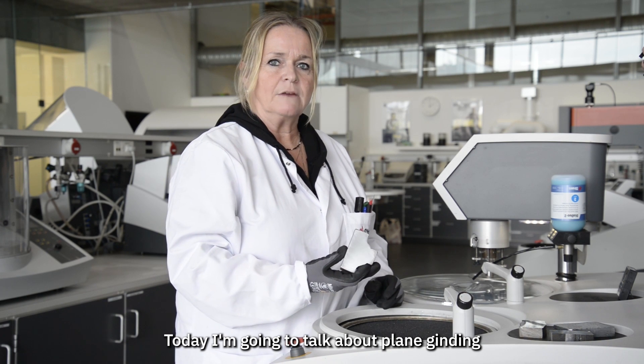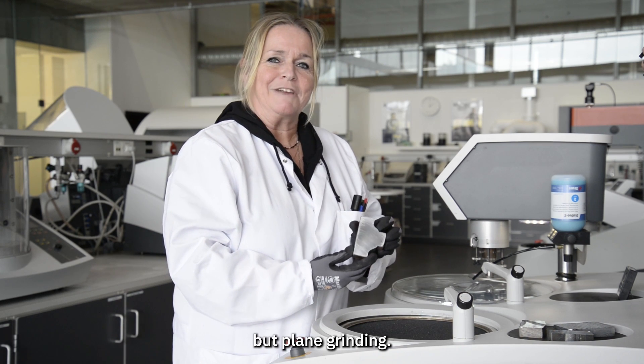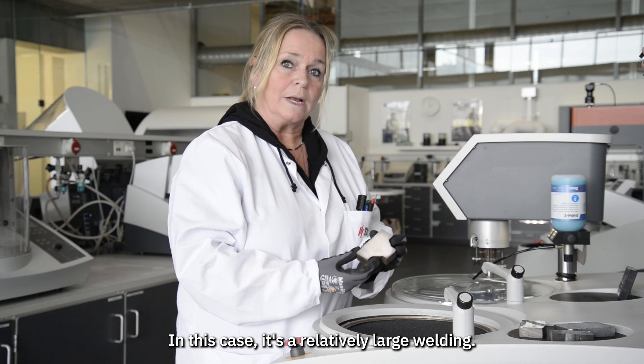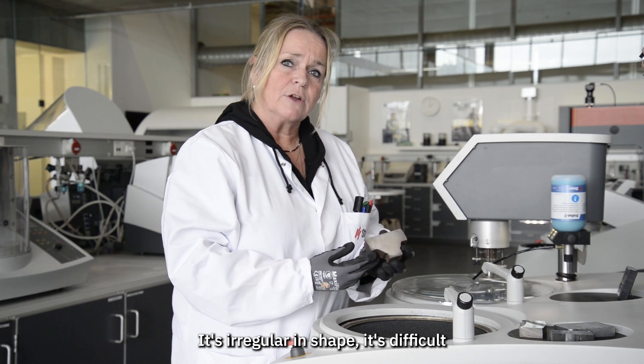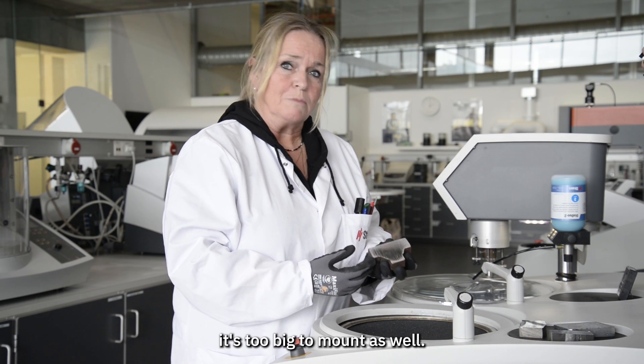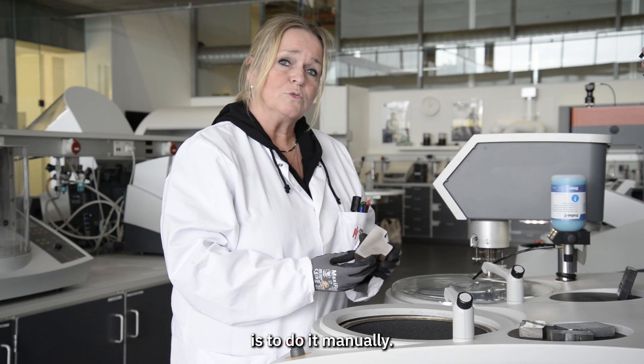Today I'm going to talk about plane grinding — not so much about polishing, but plane grinding. In this case it's a relatively large welding, it's irregular in shape, it's difficult to clamp in a holder, and it's too big to mount as well. So the only solution I have is to do it manually.